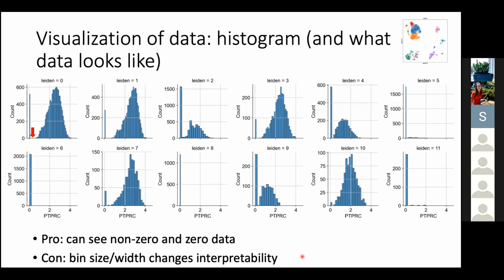And again, this is just to emphasize this gap. What that means is there are no cells that have an expression between 0 and whatever this tail is. So there's literally a gap in the expression data. Again, that's going to become important later.